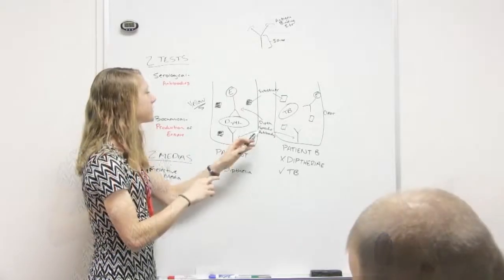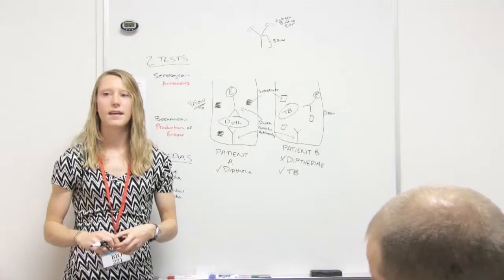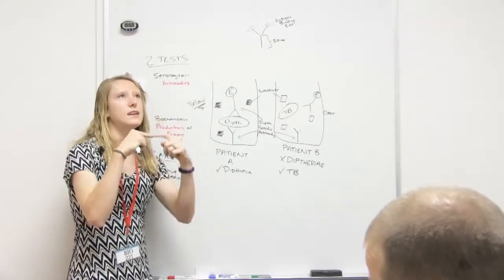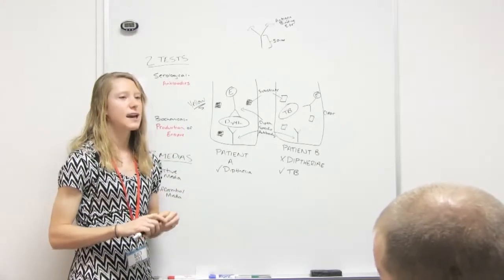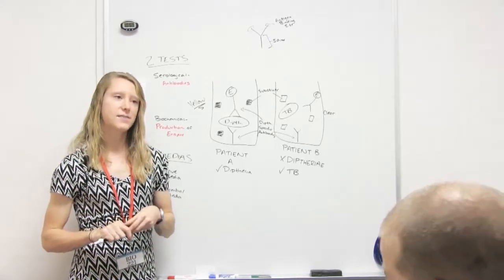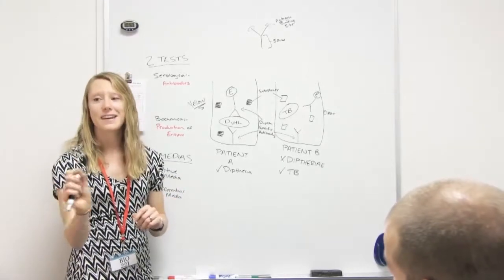We're getting close. Can I do an ELISA test on bacteria? Yes. Those are my two examples, right? What did he use as an example in the case study? H1N1, which is a virus. So can I do an ELISA test on a bacteria? Yes. Can I do it on a virus? Yes. What do I need to do an ELISA test? Specific antibodies.